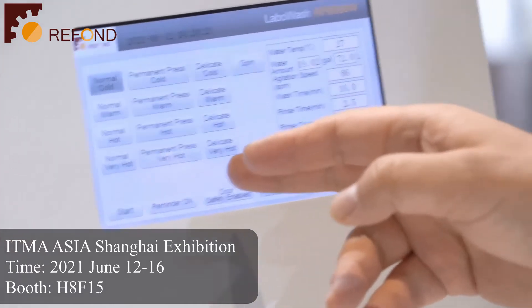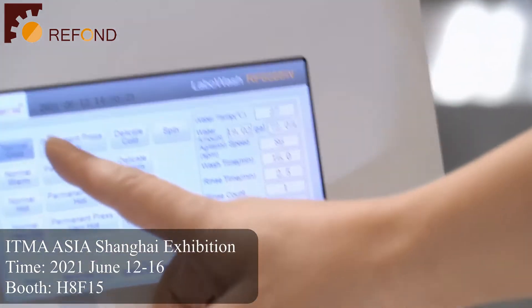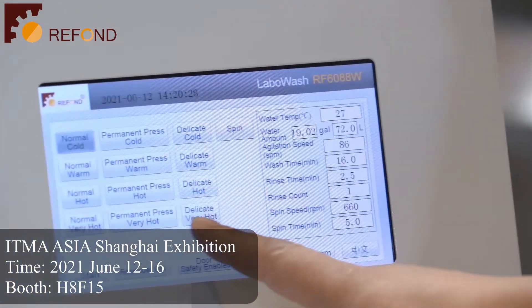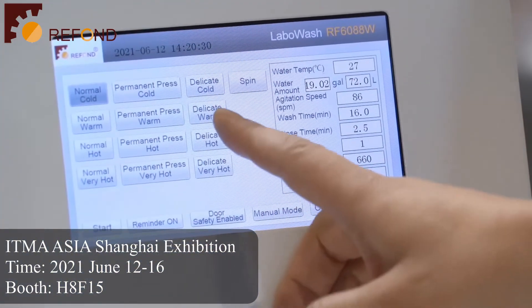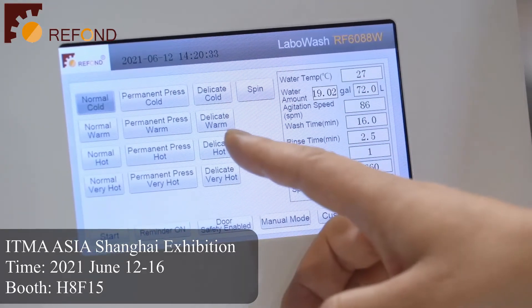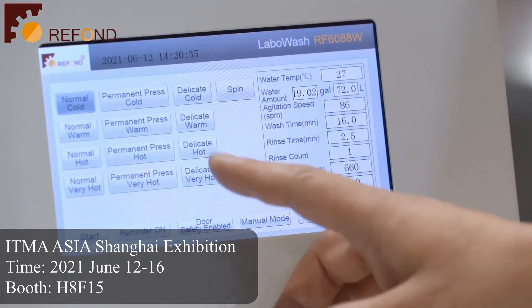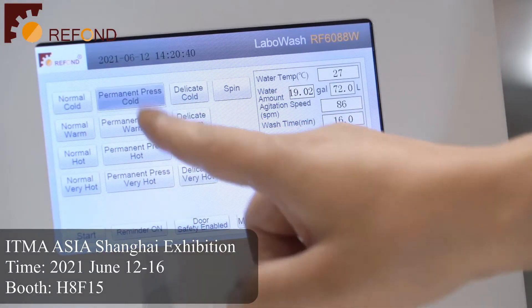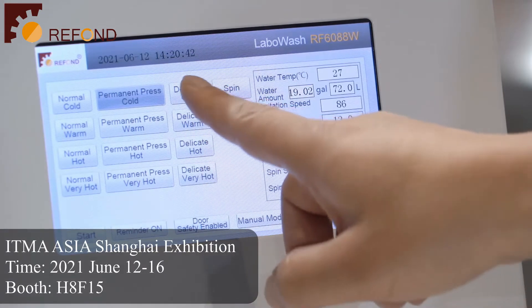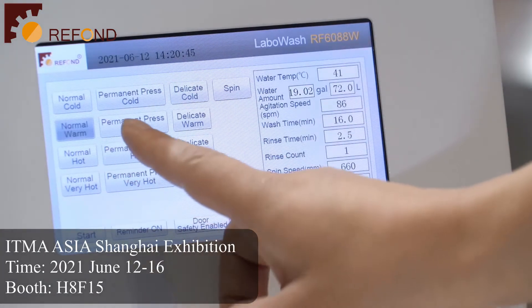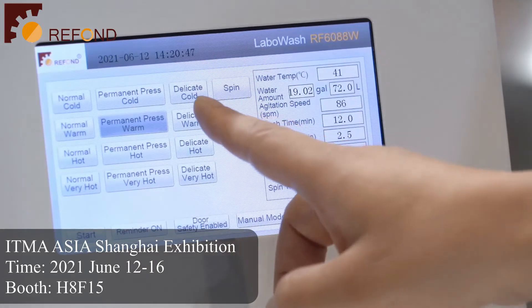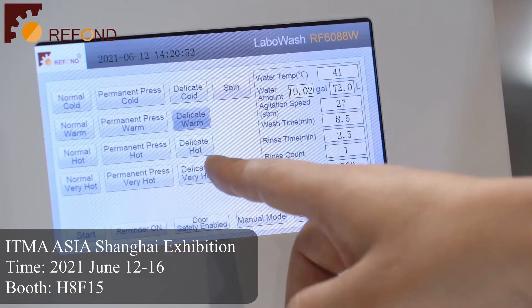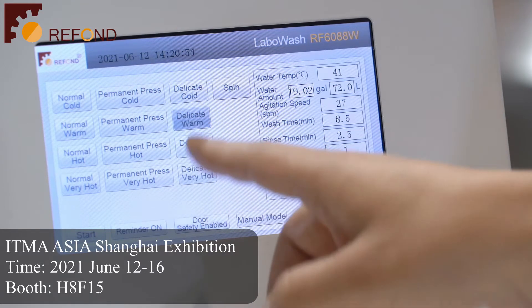This is the touch screen. You can see these are the standard testing programs, which conform to the AATCC Laboratory Procedure 1, Table 1: normal cold, permanent pressed cold, delicate cold, normal warm, permanent warm, delicate warm — all these 6 standard programs.